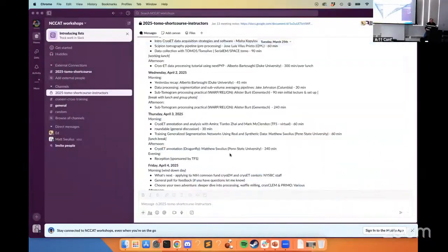So you were saying if you run that through neural seg or something, it'll make a class that detects those stars? No, what I'm saying is we denoised that real tomogram with a network that was trained on all synthetic data. Oh, I see. It's never seen anything like that star, but yet it doesn't erase it. It doesn't modify it as far as I can tell. And you see this a lot.